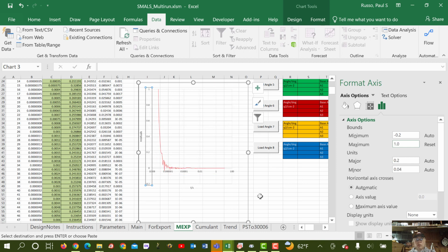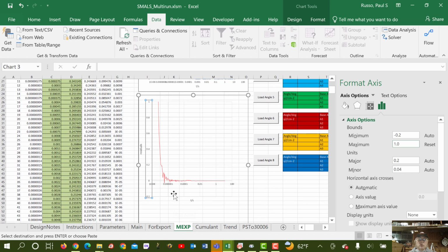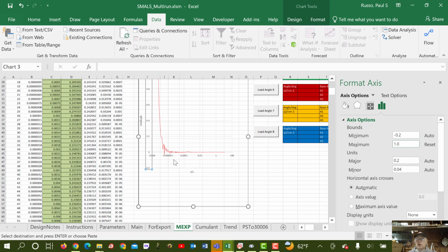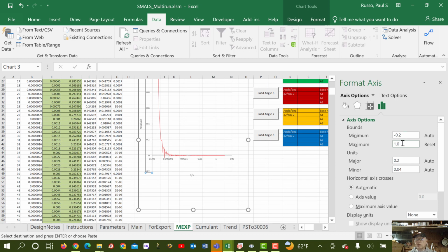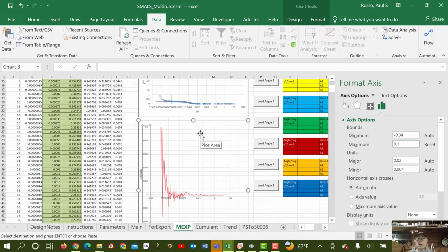So, in the regime where we're fitting, which is where these green lines are, drop down here, it's sort of random errors. I guess we can make that even a little bit more random. So you can see that, in the range where we're actually fitting the data, it's a nice random error.